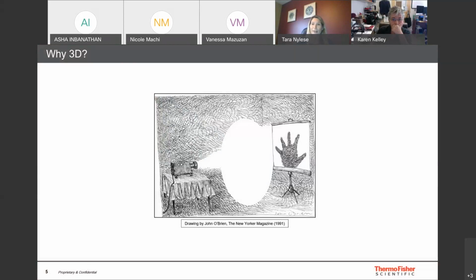When we look at that, we realize in our brains that that's actually a representation of the actual 3D object that we're taking a picture of. But our brains have to do that interpretation, and when we do that, we might be missing something based on what our current schema is.